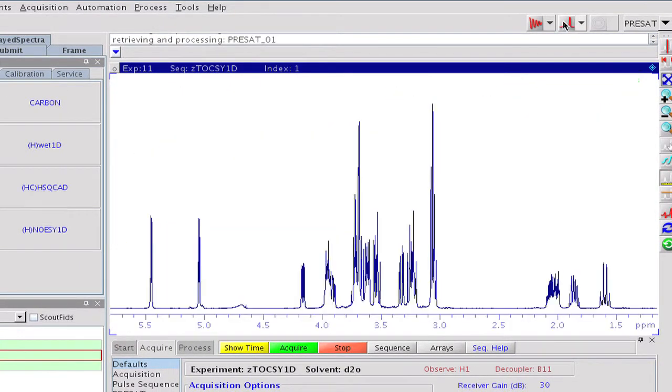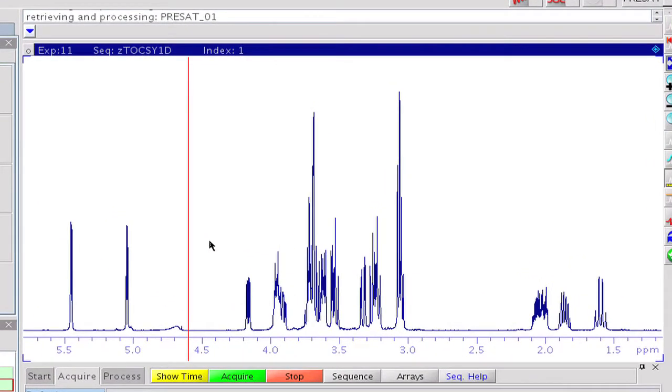Both can be achieved by positioning two cursors around the multiplet we intend to monitor. The frequency difference between the two cursors defines the requested selectivity.